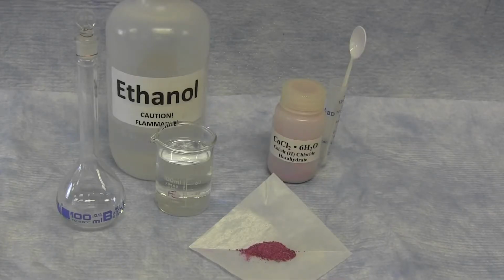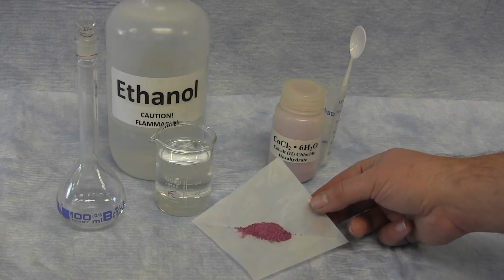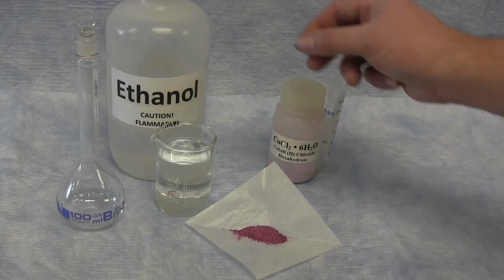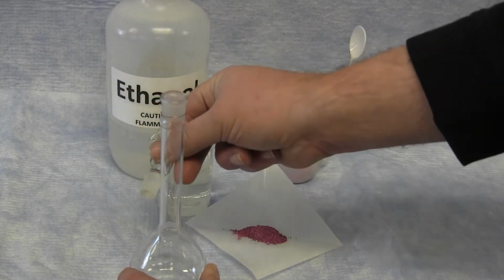To start the experiment, you will be preparing a solution of cobalt chloride hexahydrate using ethanol as the solvent. When the solvent of ethanol is used, these types of solutions are also referred to as tinctures. You will weigh out approximately 1 gram of solid cobalt chloride hexahydrate and add this directly to a volumetric flask.